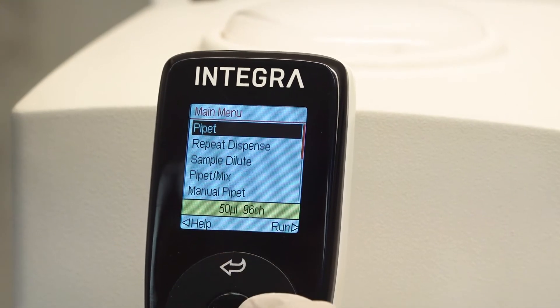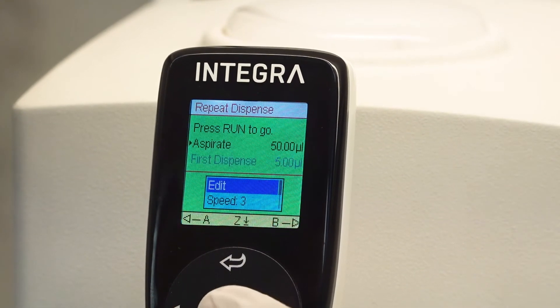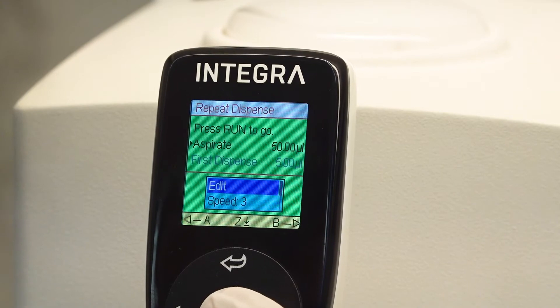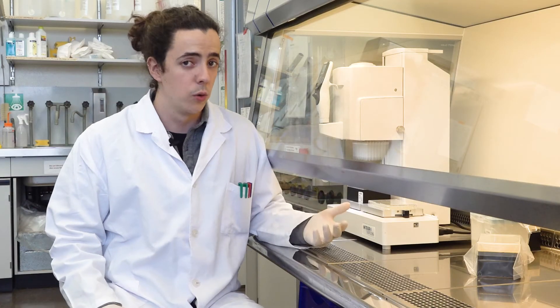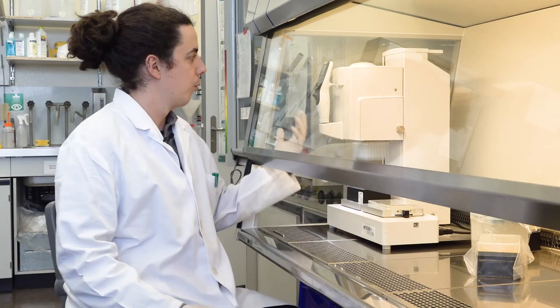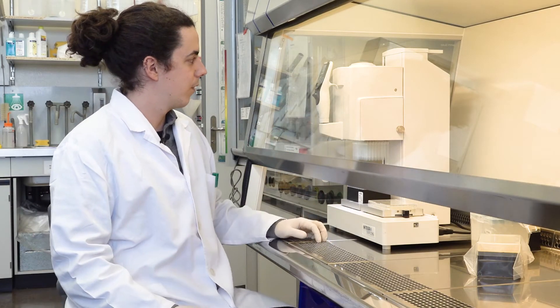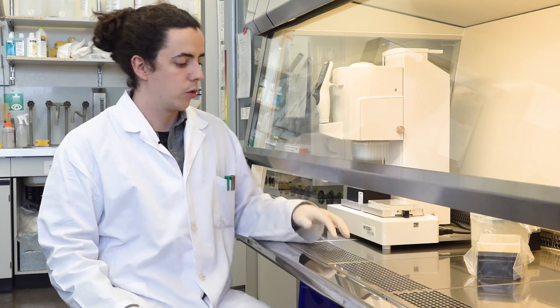It is very intuitive, so if I want to navigate through the different things that it can do, this is also a very easy thing to do.